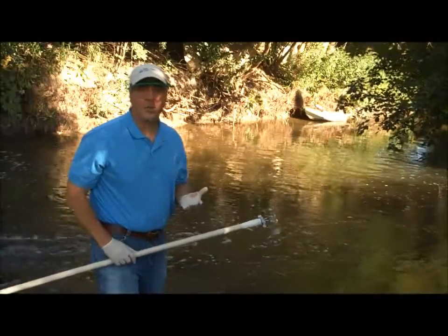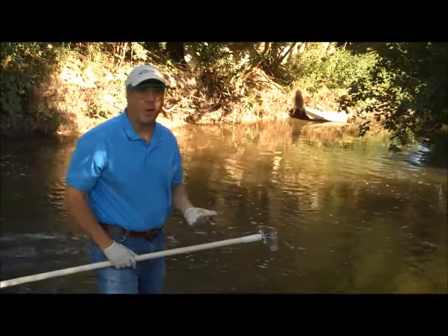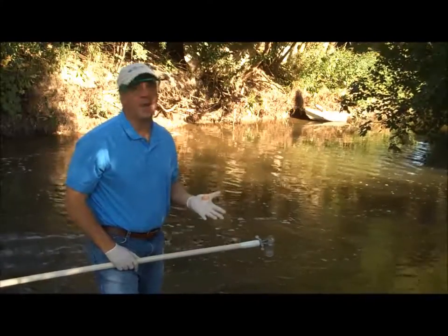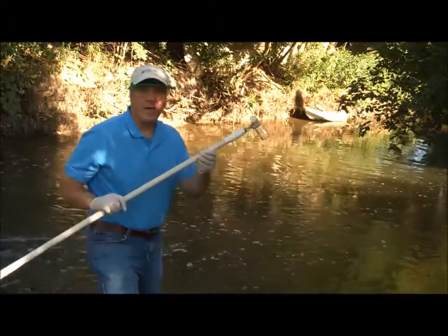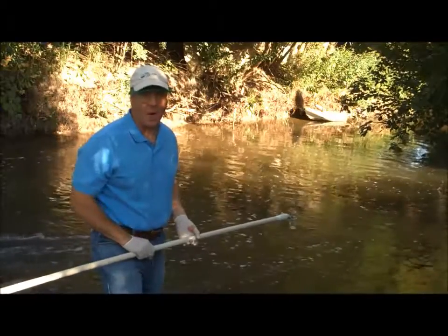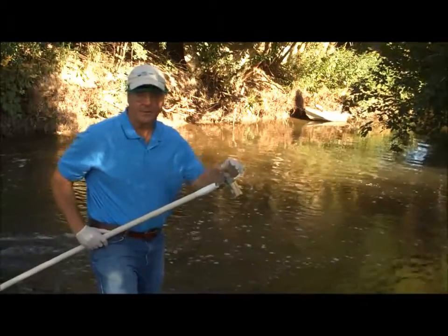Right now I want to show you how we're going to collect water, and most of the groups are going to have to collect water when they first come down to the river. Notice I'm armed with my gloves and my goggles, and I'm ready to go and collect my water. We have these poles that allow us to reach out into the river without having to get into the water to collect our water, and we have special bottles for collecting the water.